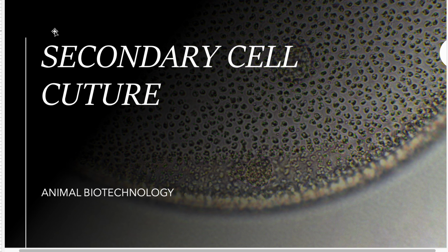Today's topic is secondary cell culture. Secondary cell culture is a technique which is also known as subculturing. What is meant by subculturing?